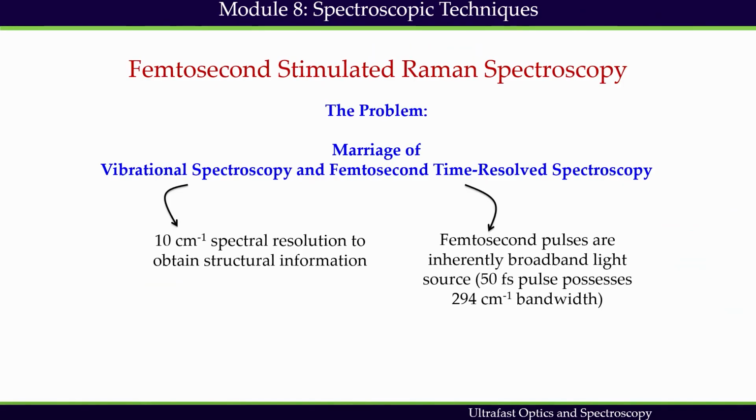Next we will discuss femtosecond stimulated Raman spectroscopy. Chemical transformation often involves formation or breaking of chemical bonds.